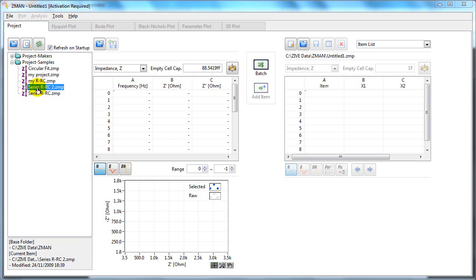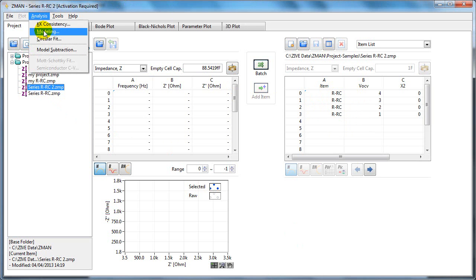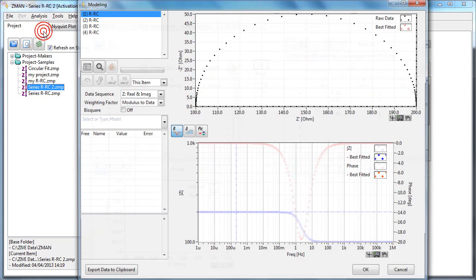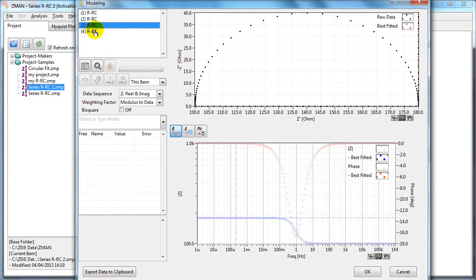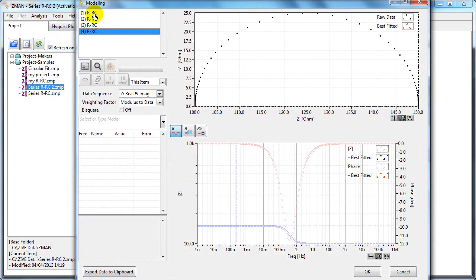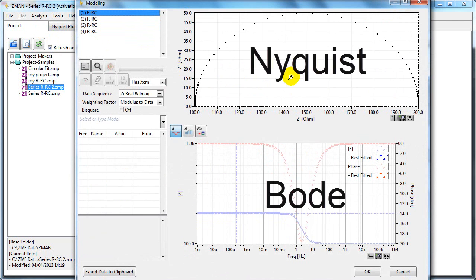If you double click on a project, you'll have data in the analysis side. You can go to analysis and modelling. And here you can see the four runs. Each one is showing the Nyquist plot and the Bodie plot.